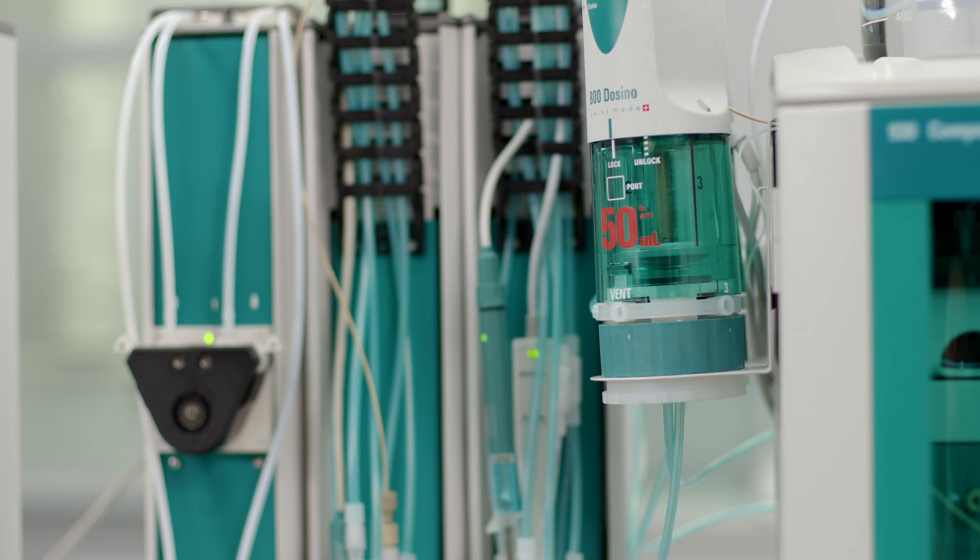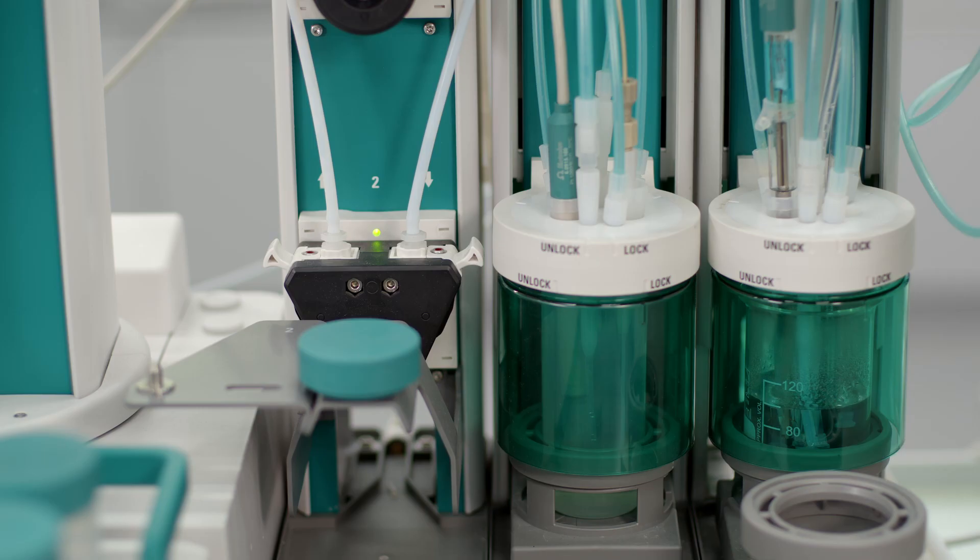Afterwards, 100 ml of sample is transferred to the second sample beaker, where the pH and the alkalinity are determined.